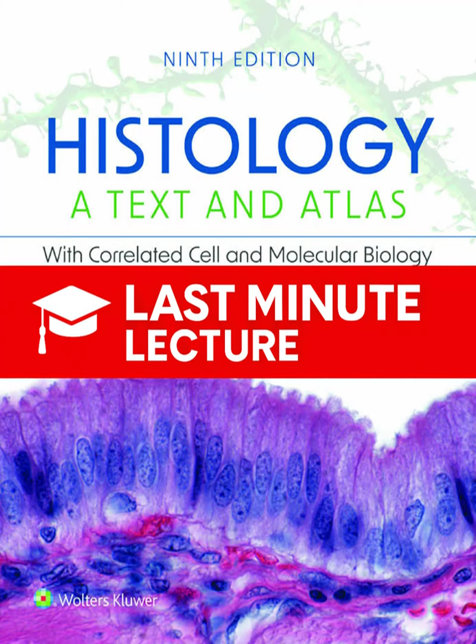So how do you do that? You have to prepare what are called frozen sections of the tissue and then use special fat-soluble dyes like oil red O. And what if you need to see really fine membrane details, like for an electron microscope? Then you need even more specialized fixatives. You have to use ones that contain heavy metals. And the main one there is osmium tetroxide.